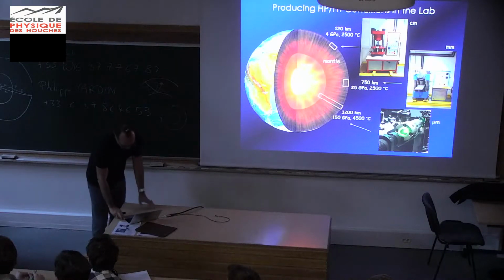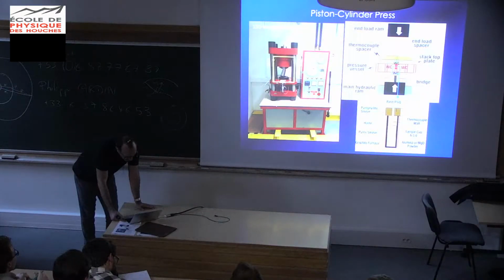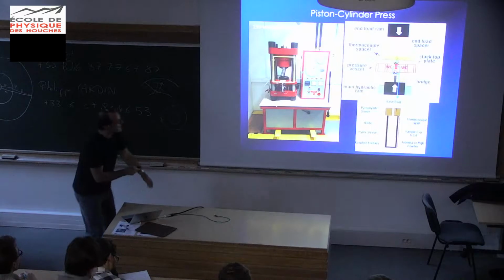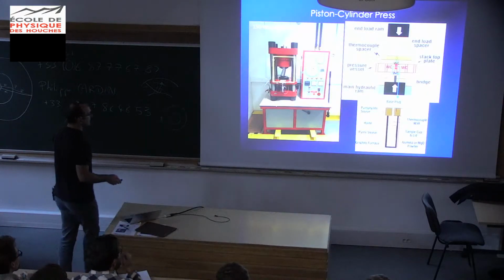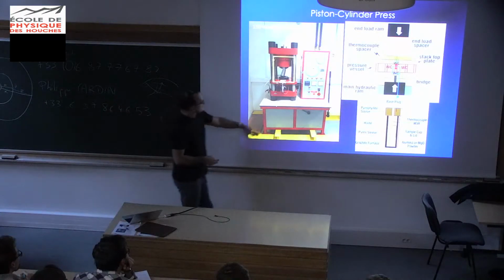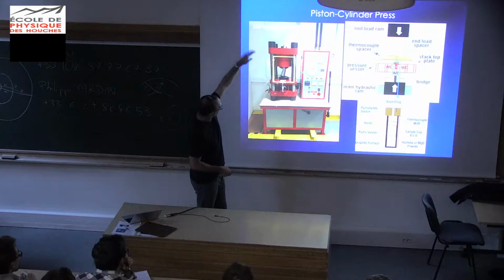Okay? But we'll go through this while I show you the instruments one by one, okay? So we'll start with the piston cylinder press. This is a picture here. For the scale, if I stand here, I would get up to here. So I guess that's about 2 meters, the whole thing.